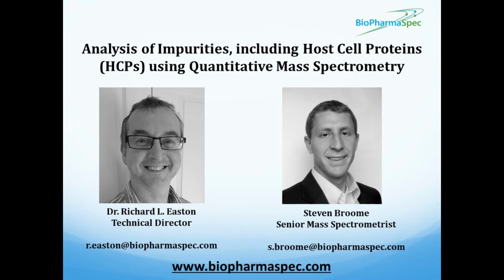And as far as methodology goes for how we check for these impurities, we rely on mass spectrometers for the detection. Mass spectrometers provide high sensitivity, allowing for detection of impurities that are often at really low levels. And mass specs provide quantitative data, which not only allows you to assess what's in the sample, but also tells you how much of each impurity is in the sample. Both of those are very important to know when you're assessing impurities.